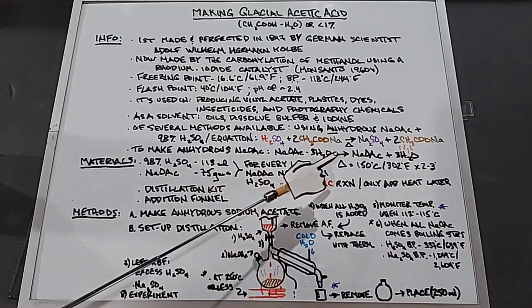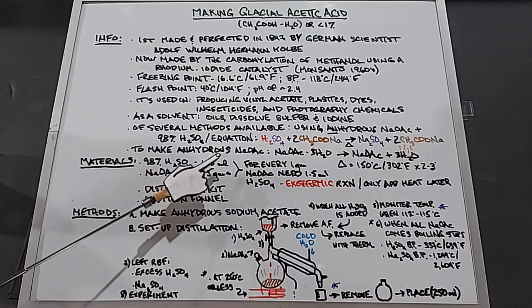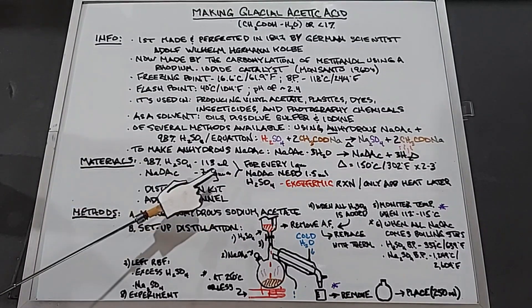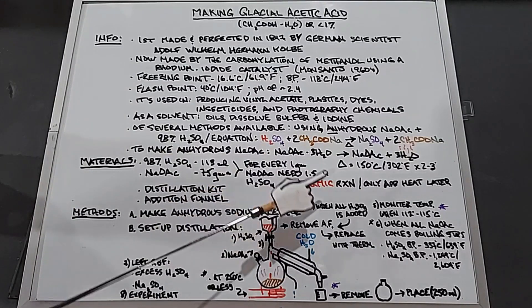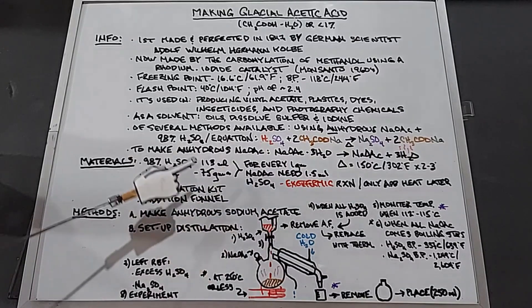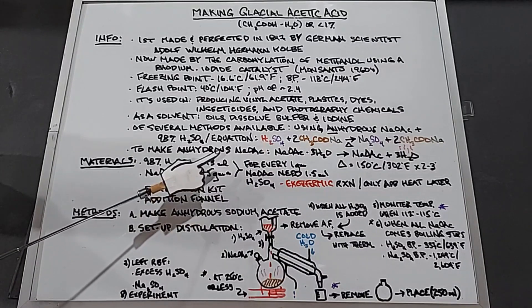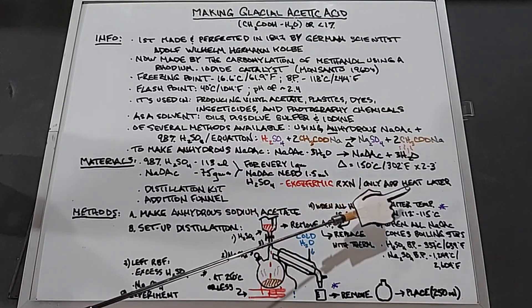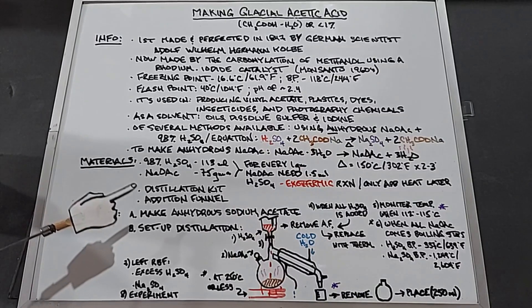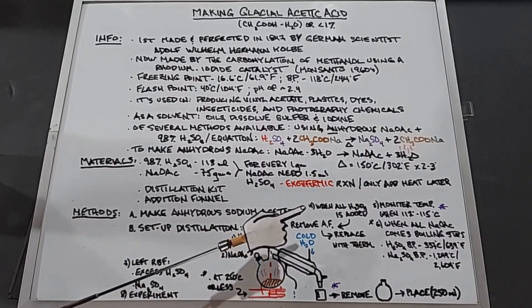The materials we need are 98% sulfuric acid — 113 milliliters — and 75 grams of anhydrous sodium acetate. Essentially, for every one gram of sodium acetate anhydrous, you need 1.5 milliliters of H₂SO₄. When you mix these two together you get a very exothermic reaction, so we'll only add heat later in the experiment. We also need a distillation kit and an addition funnel.